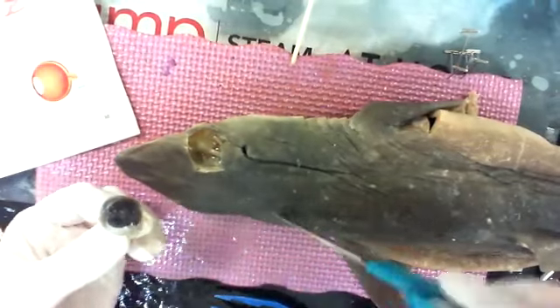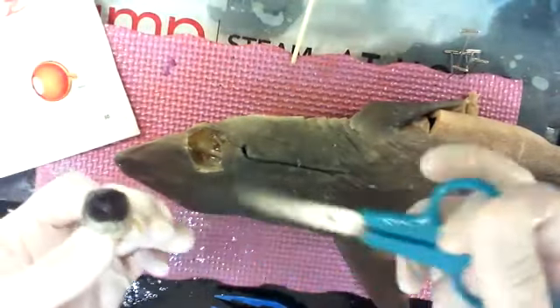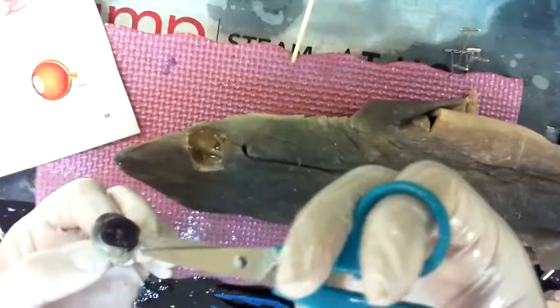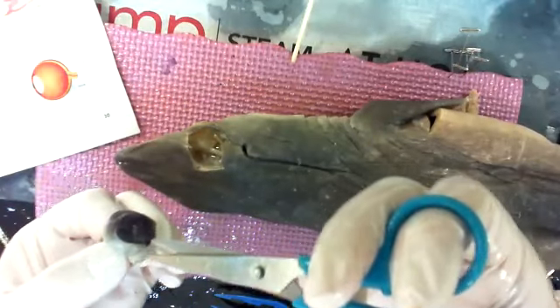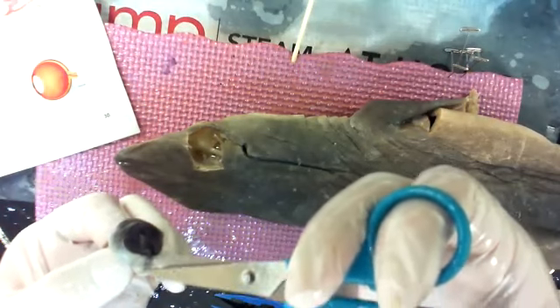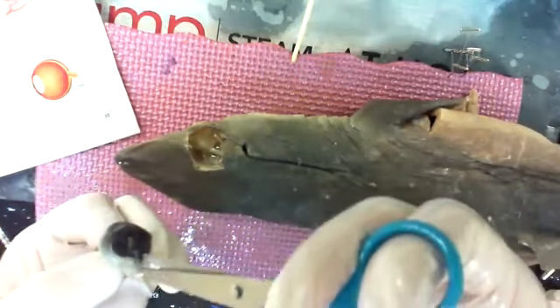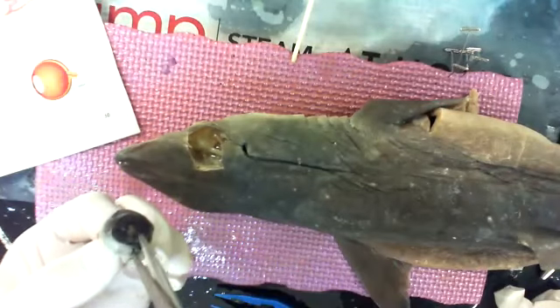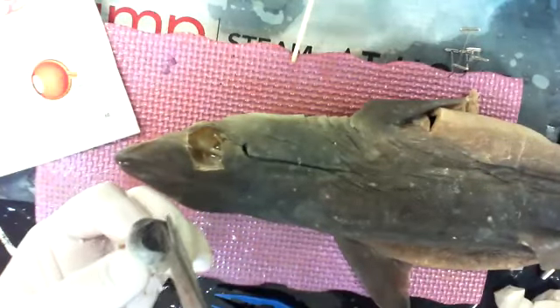When you cut this, I always look for folds. I don't want to stab it. I want to find a fold and cut. Oop, yep, I just punctured it. So there was a crease and I just cut the crease like we did to get into the shark earlier. And now I'll just snip down a little bit, snip down a little bit. All right, I'm gonna snip up a little bit.